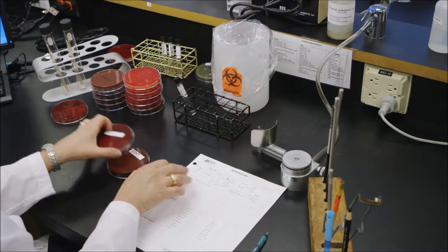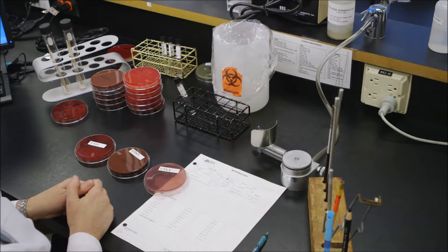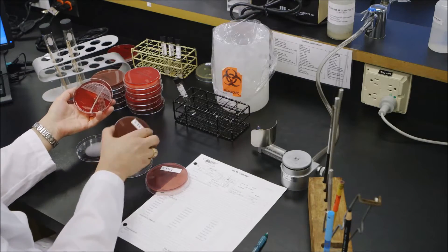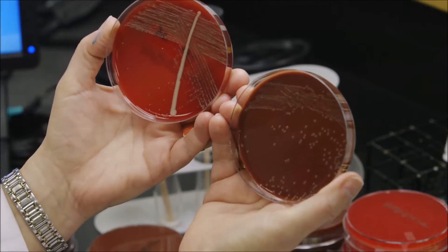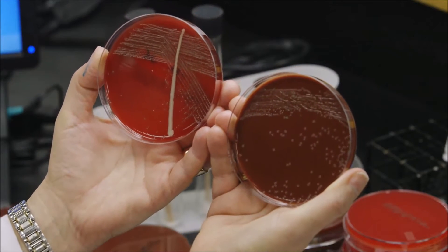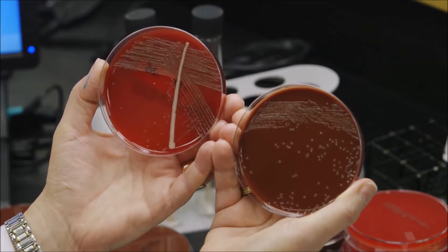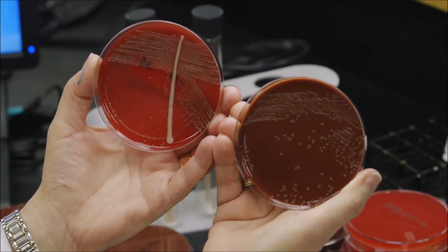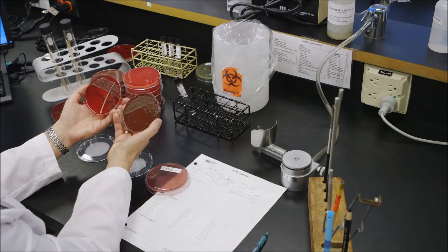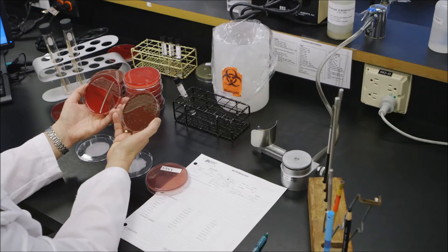The first thing I do is put the plates side by side in front of me and I always lift up the blood and the chocolate side by side and that's to compare the growth requirements. Remember that Haemophilus requires enriched conditions, not only the media but the CO2 and it doesn't grow well on a blood agar plate without the help of a staph streak.